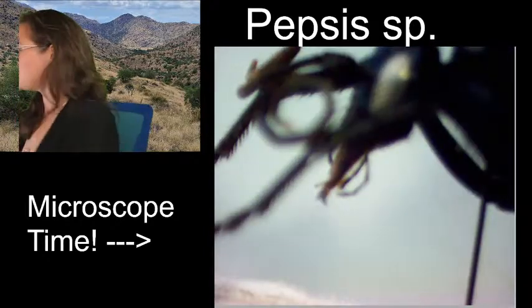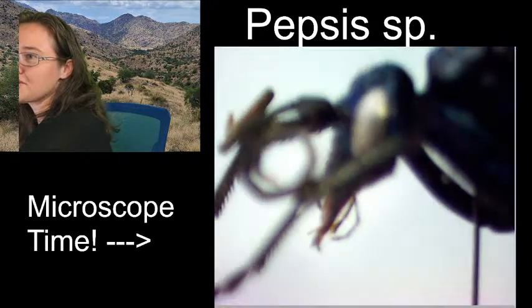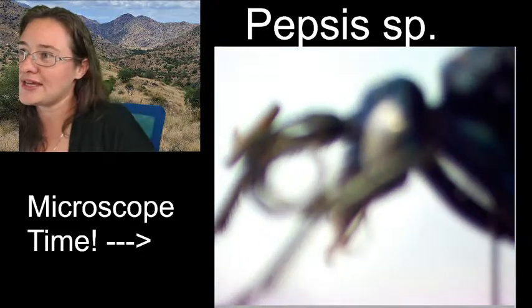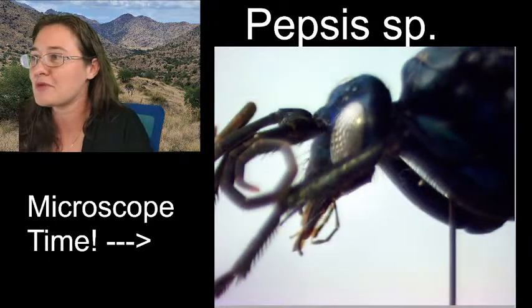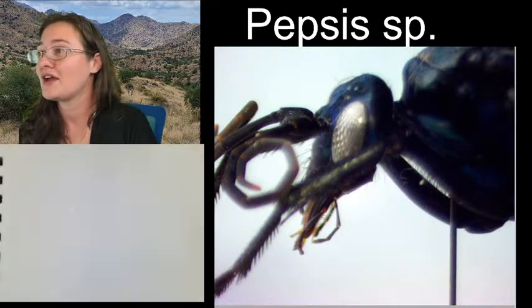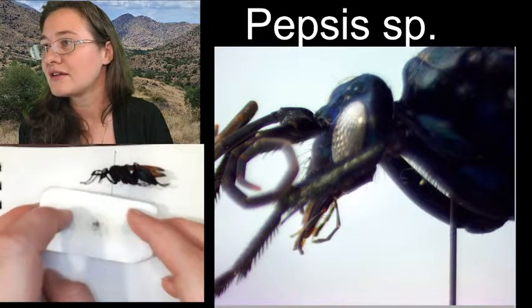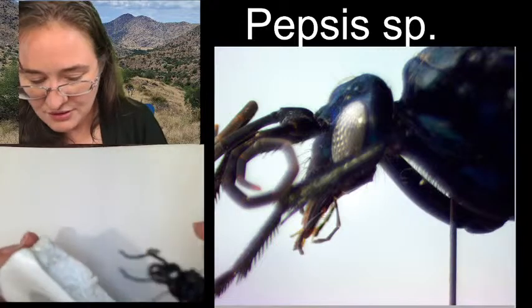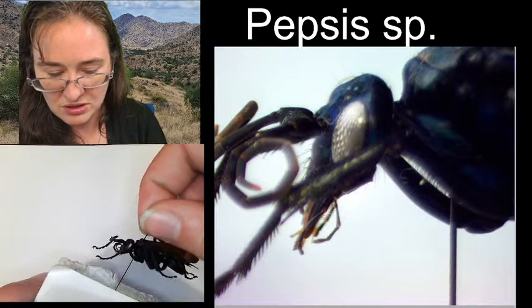So what I think I'm going to do, because I know that a lot of us like to get the overall sketch done first and then go back in for fine details, I'm going to go ahead and get her kind of in focus just on the head right here, and then I'm going to pull her off to the side and put her on top of my paper like this. And maybe that will help sketch her.